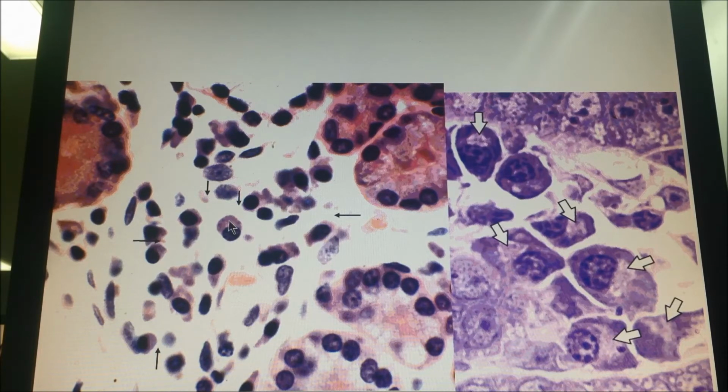What is the function of the plasma cell? Yeah, it produces antibodies. Excellent. You see here a large amount of plasma cells. So you deduce what? This is an inflamed tissue. And this inflammation, is it chronic or acute? When do plasma cells appear? Is it in chronic or acute inflammation that more plasma cells appear? Common sense, come on. Definitely the chronic. Chronic means long-standing.